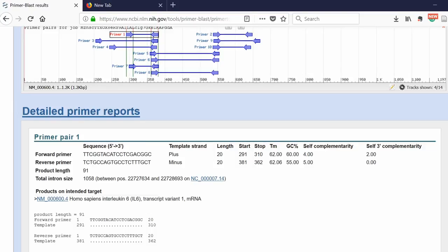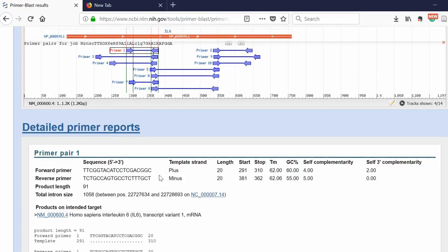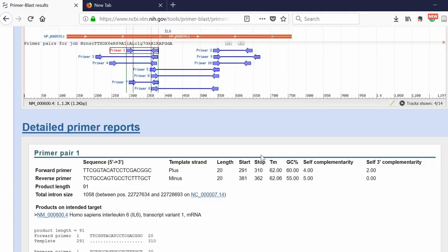In between those exons, there is an intron that is 1,058 base pairs long. If I did a PCR and I had genomic DNA contamination in that, the product size that will be produced will be 1,058 base pairs plus 91 base pairs. So that's how I'd know if I have any genomic DNA contamination in my PCR. The next column will tell you what strand the primer is binding to, the length, where on the gene it binds to - the start and stop in base pairs.